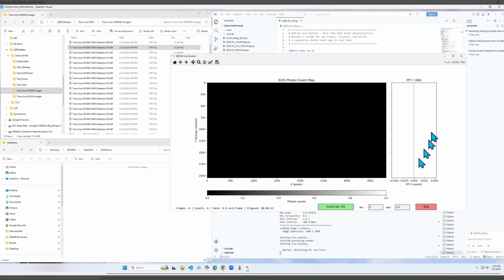On the side, the integration along the excitation energy axis will give you a line shape of the so-called X-ray absorption PFY. The use of that is to tell you the data you are collecting actually makes sense, so you won't waste too much beam time to collect trash data.